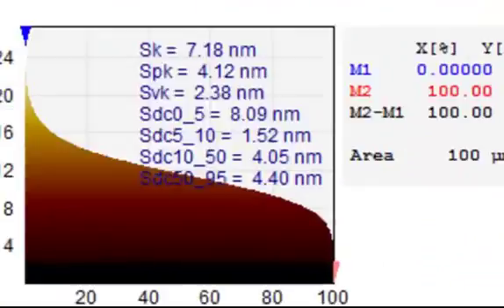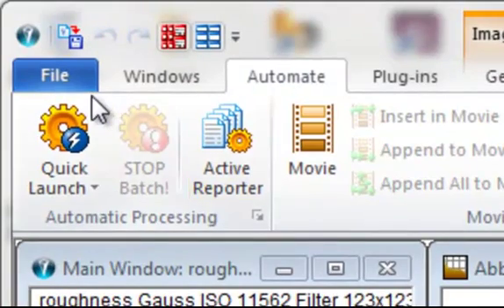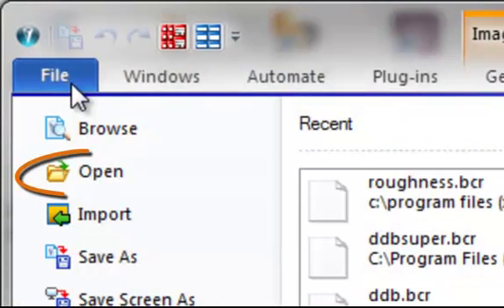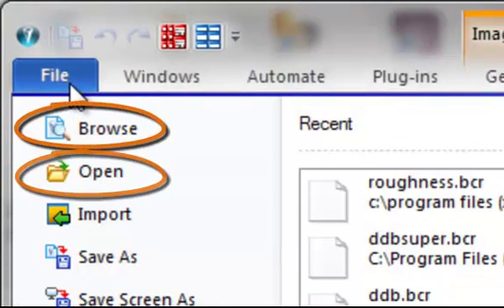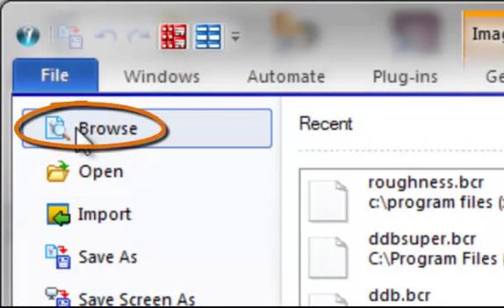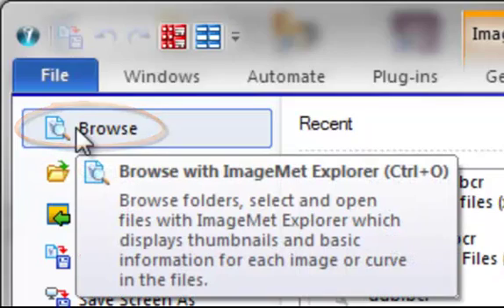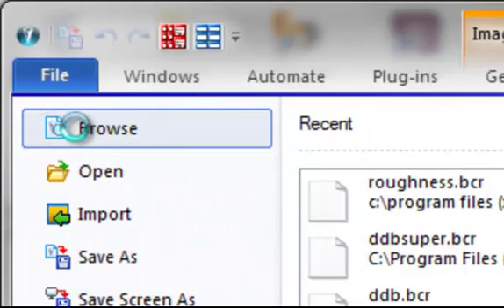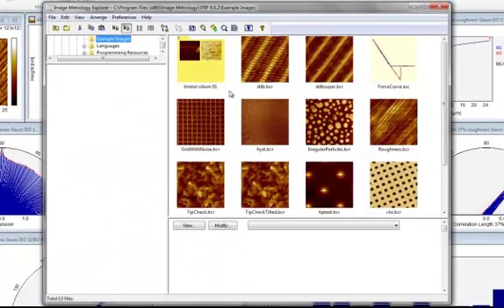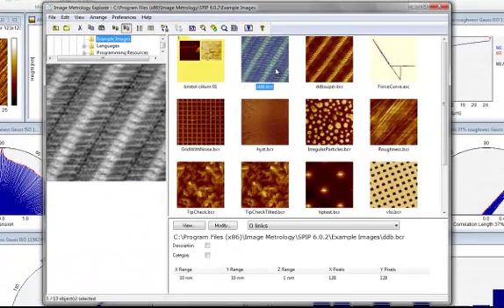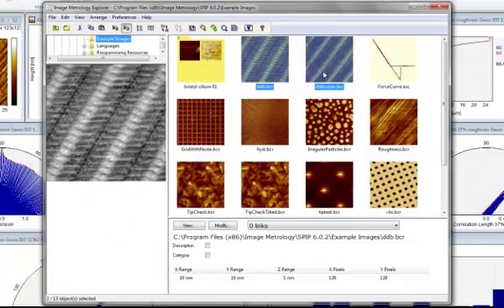You can load files for batch processing by use of either FileOpen or the ImageMed Explorer. We'll use the ImageMed Explorer as it will allow us to see thumbnails of all the supported file types in SPIP. Simply select the files you wish to add to the report and open them.